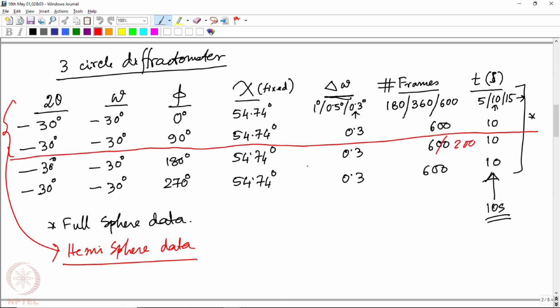So, what is this data that we are getting? This data is a frame by frame recording of the diffracted beam intensity that appears on the screen. We convert that diffracted beam intensity, which is the number of photons falling on that particular pixel in the case of CCD or CMOS detectors, into a signal in terms of voltage and then we record it.